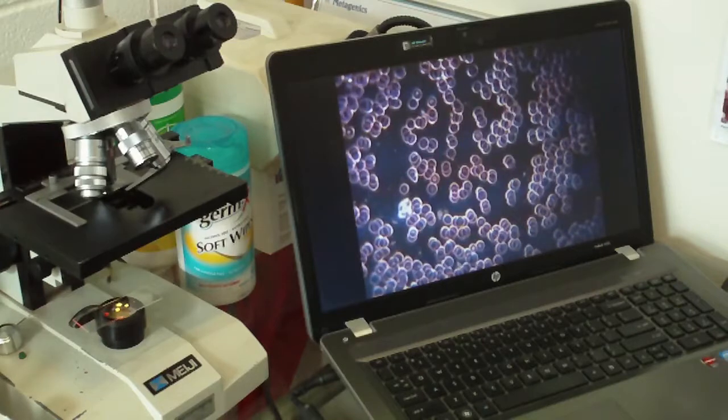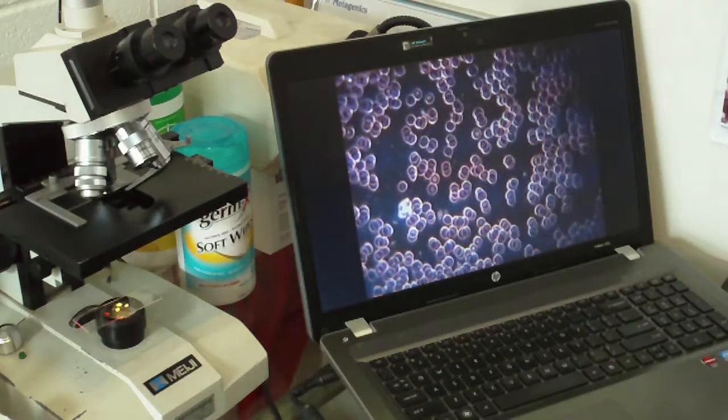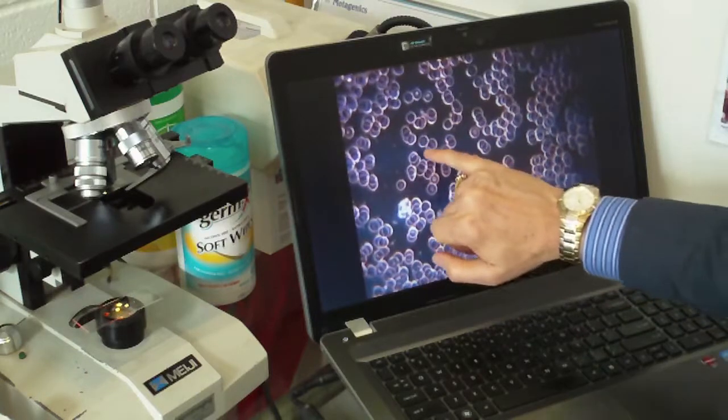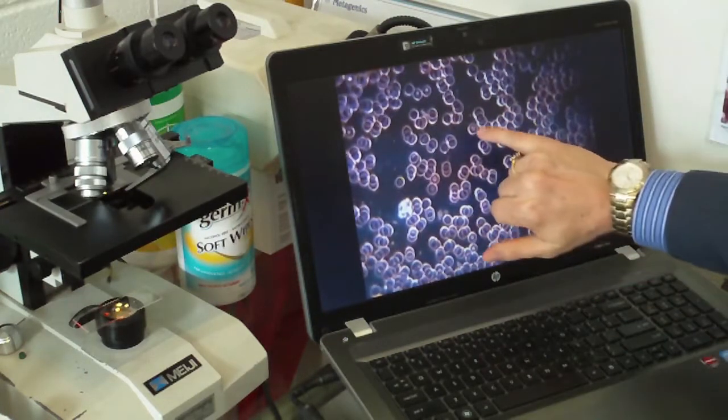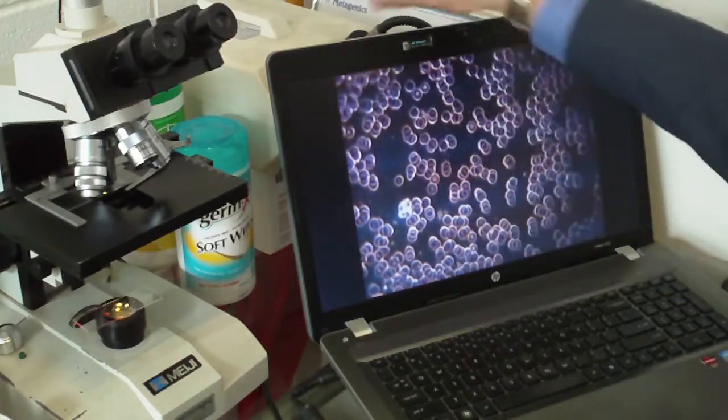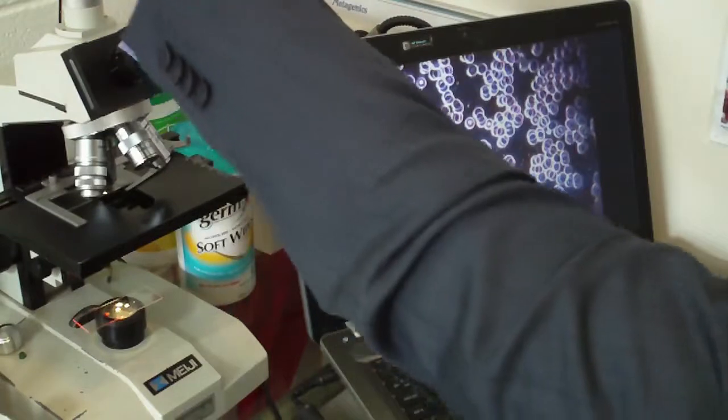And we've got ways of figuring these things out from questionnaires and all sorts of other tests that I do, but this gives us the indication it's there. So this is getting a bit closer to normal. We would like to have these red cells more separated. But this basically, we can start to see the shape of these cells. Now, if we had lots of these ones, I'll blow the brightness right up so you can see. If I zoom this up, now this is a false annulocyte sign because I know this patient well, and they're not iron deficient.